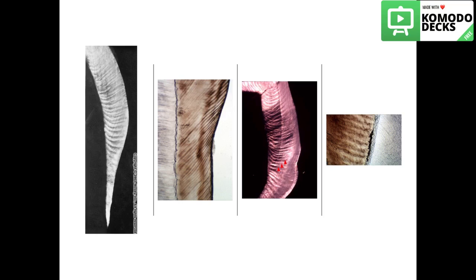Don't forget that the Hunter-Schreger band is an optical phenomenon, which means we can only see it when we expose the tooth to light. You can see the bands in all these sections. These bands strengthen the enamel structure.